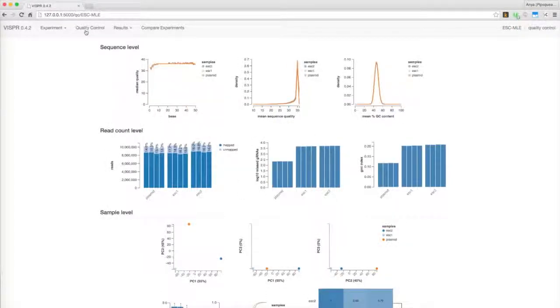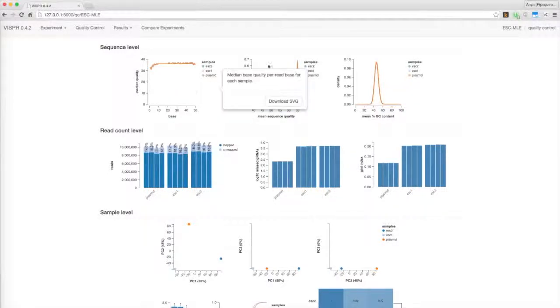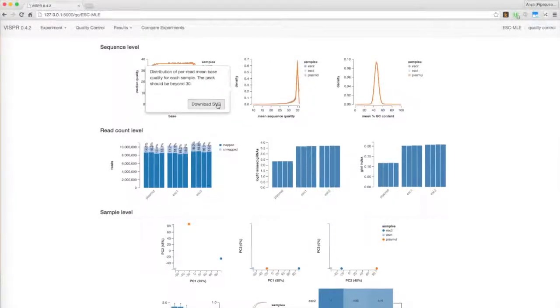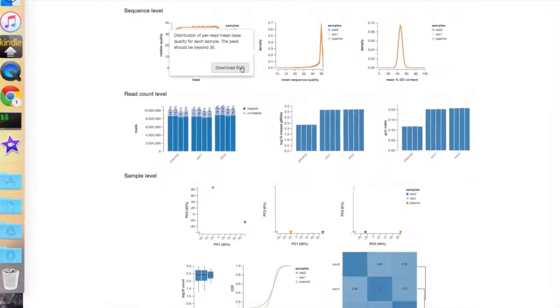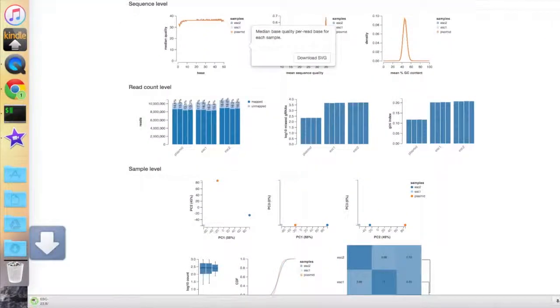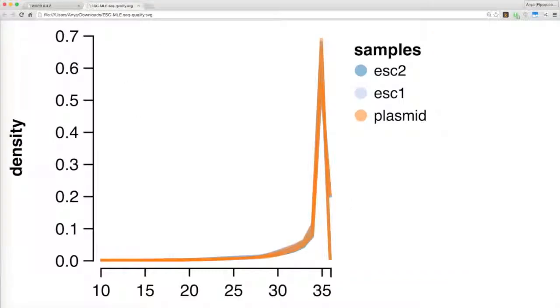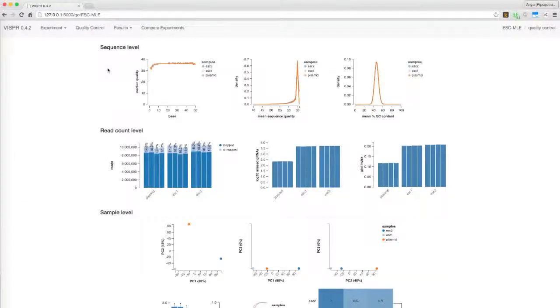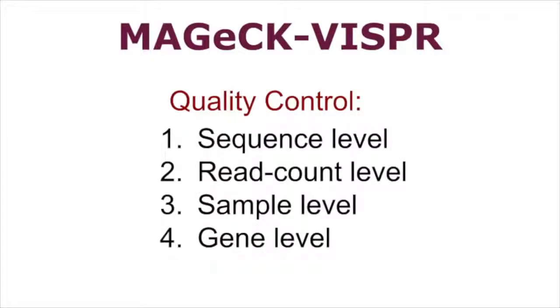You'll see that this page contains a large number of visualizations. Just by hovering over them, you can read about their functions and even download them as vector files. Apart from finding essential genes with MAGIC, a central purpose of MAGIC Vispr is collecting quality control measurements. Vispr divides these into four levels, three of which can appear on this page depending on what data is given the workflow.